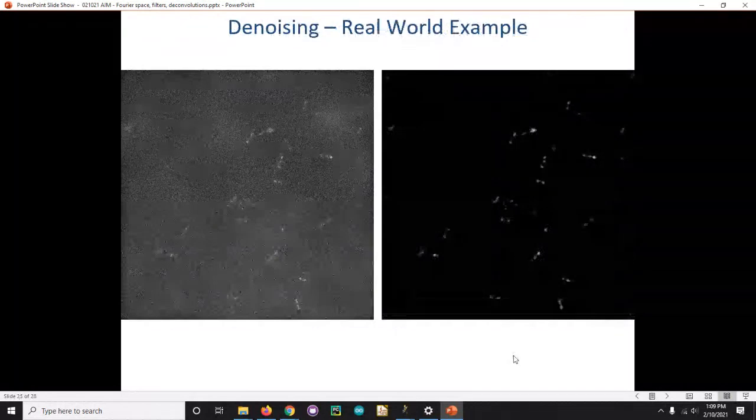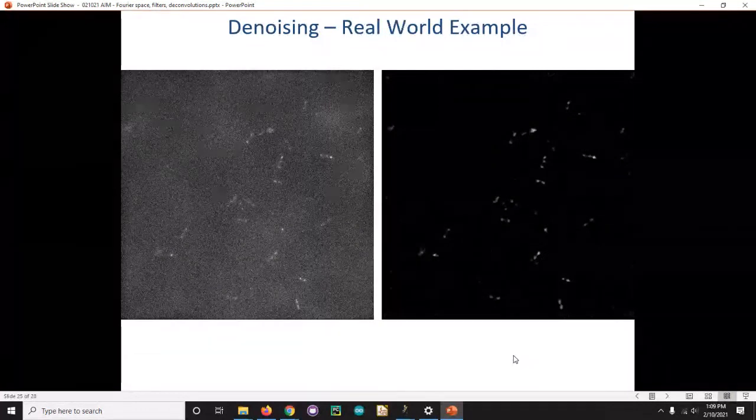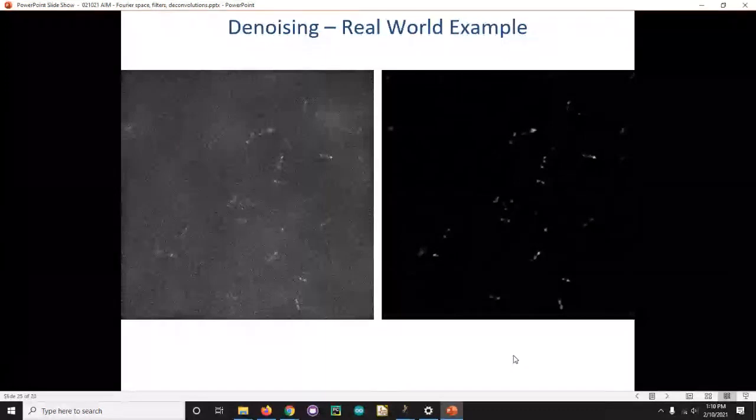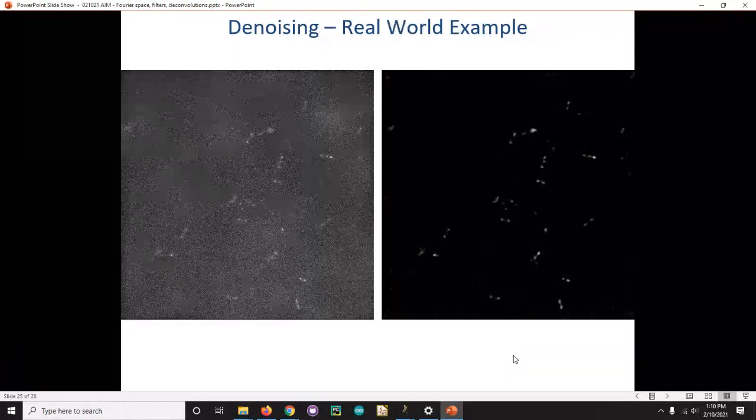So now we're going to get to a real world example. I was really hoping to get to this as my counter argument to Yuri's talk, which is really important to talk about, because one thing he kind of failed to mention was he was not just solving a noise issue, he was solving a low information issue. When you use deep learning, the way you solve low information is you're convolving your guess of what the data should look like with a little bit of information that you have. In other words, the final representation is a mix of your model and the data.